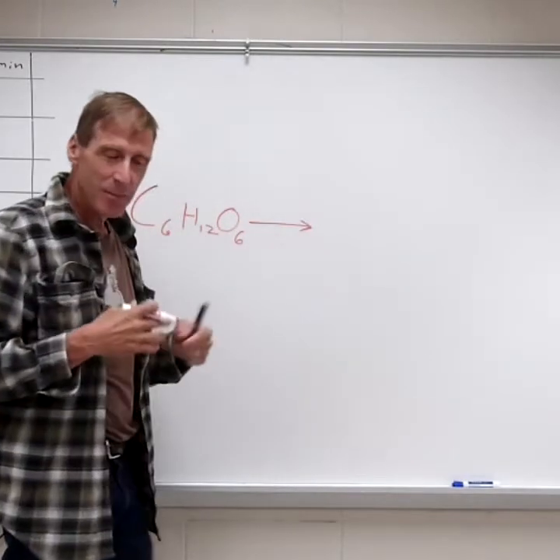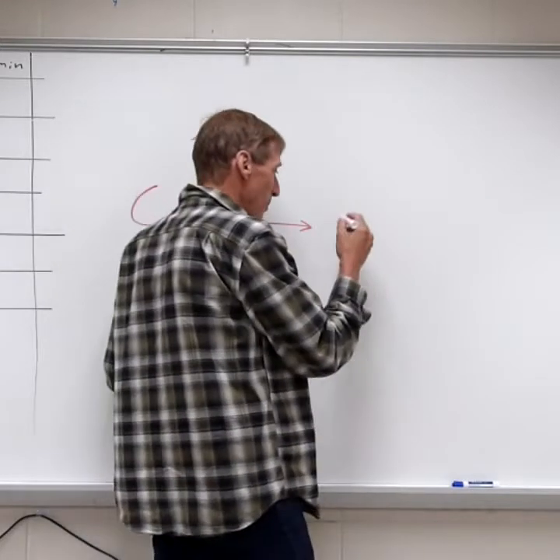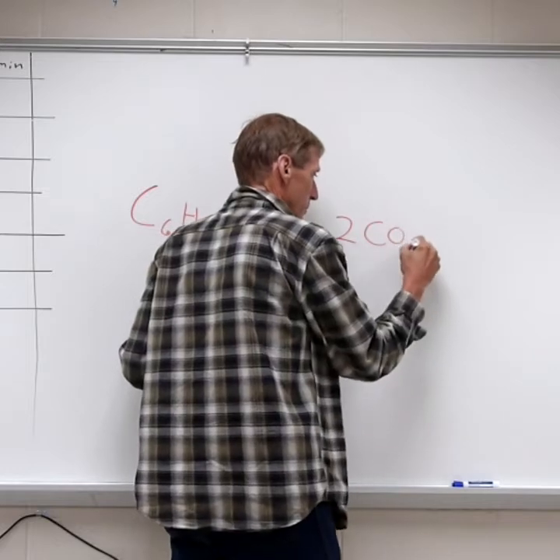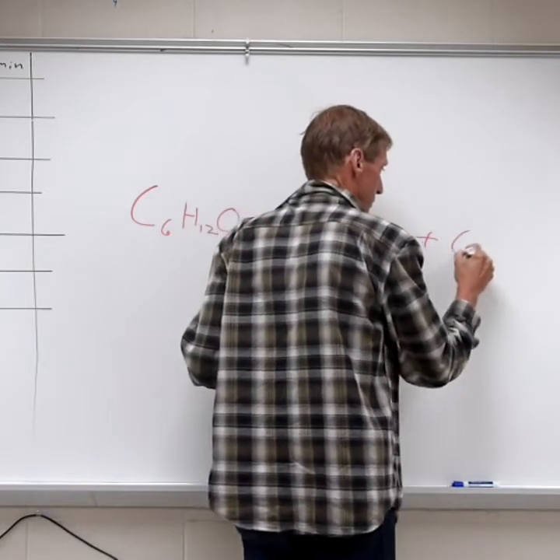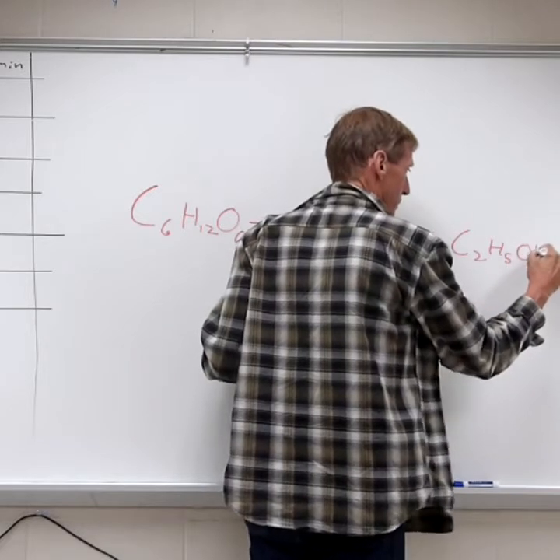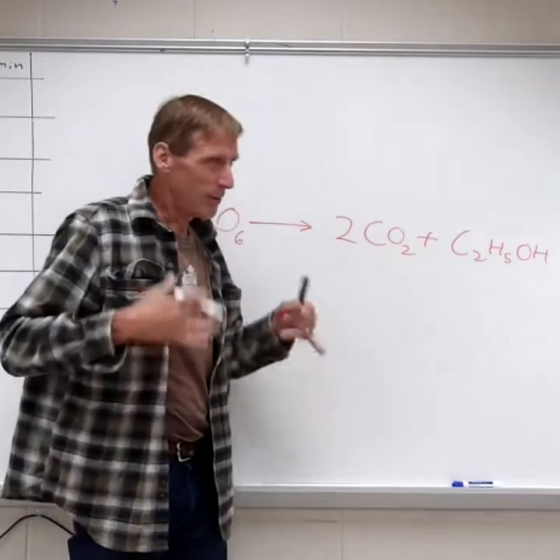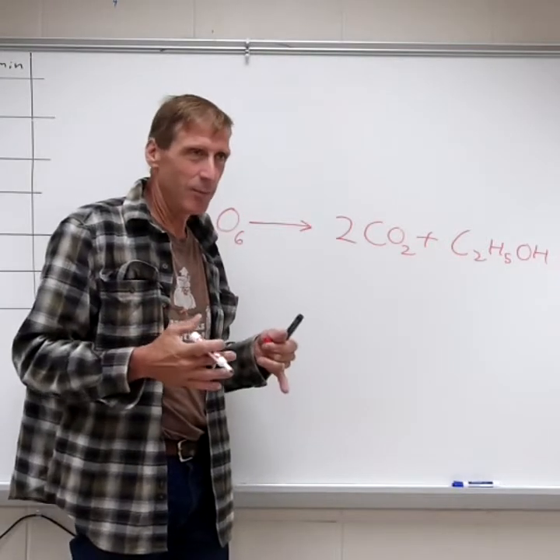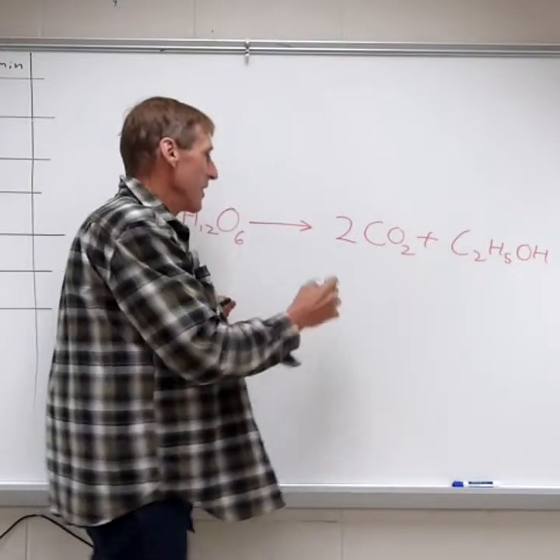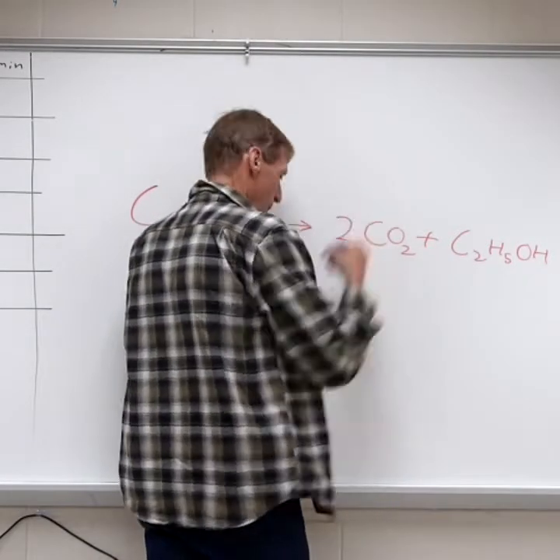The fermentation pathways allow you to break this glucose down and produce, as sort of a byproduct or end product, carbon dioxide. Again, these are all the atomic symbols. You're working on them in 112, or you already have carbon, oxygen, hydrogen. This stuff right here is going to be important for our lab.